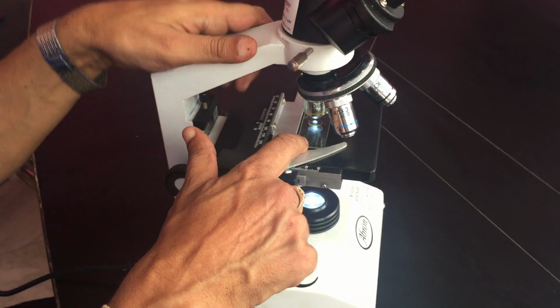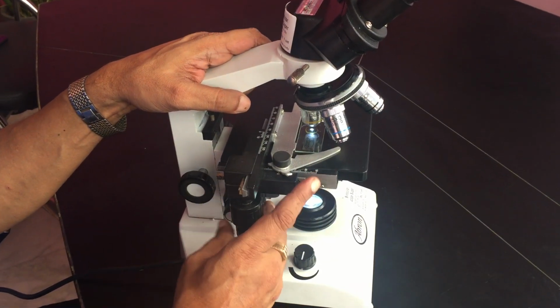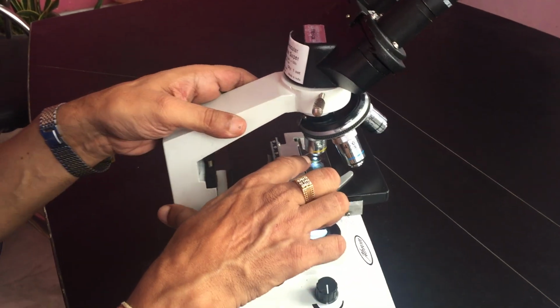Now let us say I am using it on the 10x objective and put the sample on this side. Now I can see the light. Here I can see the light.